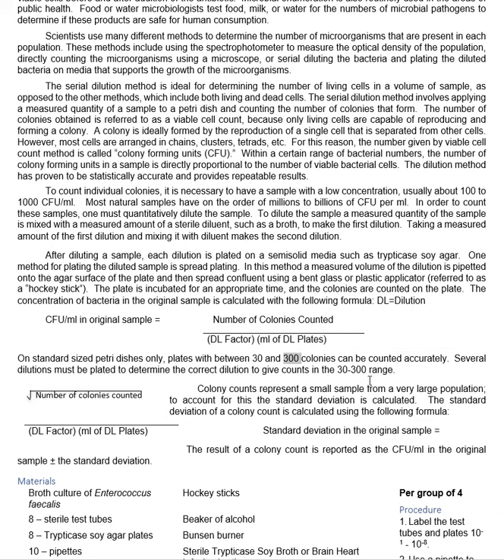So as you might expect, the higher the dilution, the less bacteria. Some of those will fall way below 30. Some of them will go to 0. Matter of fact, if I recall right, most of the time 10 to the minus 7th and 10 to the minus 8 had no bacteria at all. And the 10 to the minus 1, 10 to the minus 2 sometimes will have way more. Some of them are actually a bacterial lawn. There are no individual colonies. So that's going to be our range.